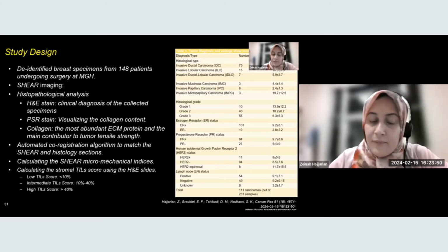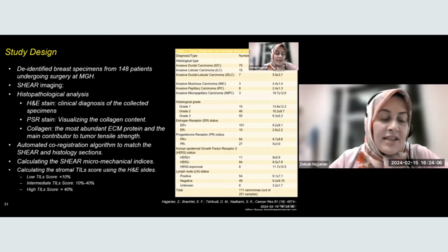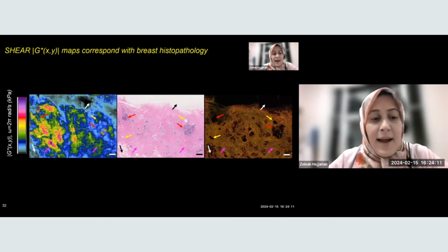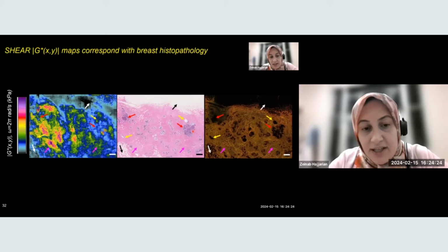We also did some texture analysis on the maps of the mechanical properties that we had obtained across the tissue landscape. And also on the side, we looked into the concentrations of stromal tumor-infiltrating lymphocytes as markers of the immune response across the tumor landscape. So this is an example of a normal breast anatomy that we talked about. You can appreciate the adipose tissue, the wavy, soft collagen, and terminal ductolobular units and ducts and lobules that you basically observe there in purple in the histopathological section.